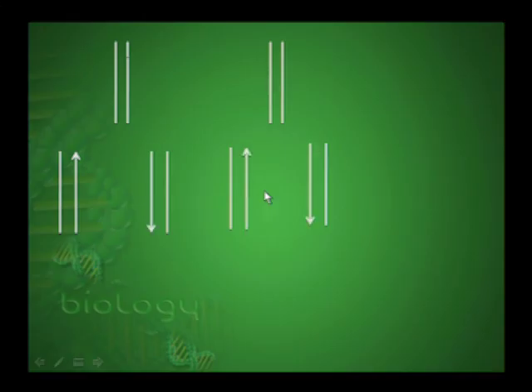And so now we've got 2 copies of our genes, we'll heat and cool again. So the heating process will cause denaturization. In the cooling cycle, we'll get reannealing, the DNA polymerase will bind, and then extension of the strands. And that will double our copies of genes again. So what happens in this process is that with each heating and cooling cycle, we effectively will be doubling the number of copies of genes that we have.